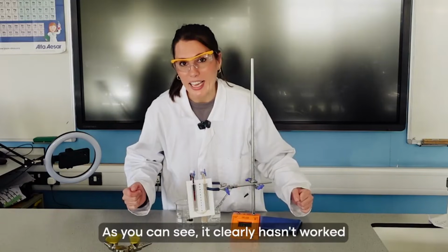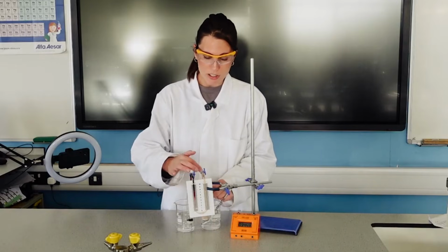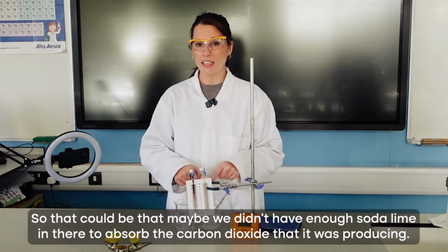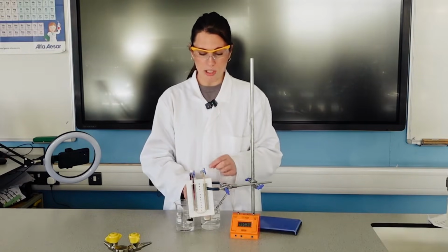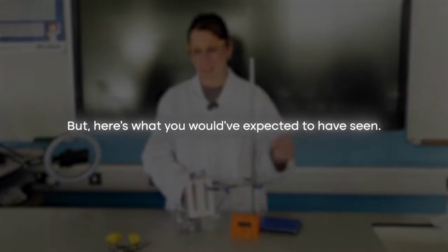As you can see, it clearly hasn't worked, and I think our yeast has potentially been overactive and it's managed to bubble through. So that could be that maybe we didn't have enough soda lime in there to absorb the carbon dioxide that it was producing. And so there's now so much carbon dioxide, it's all bubbling over and it's going into this one. But here is what you would have expected to have seen.